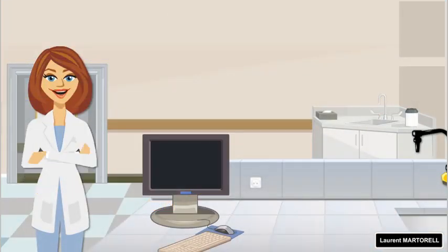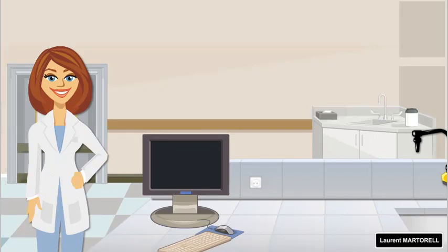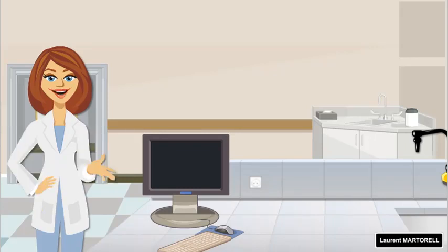Hello. Welcome to my lab. My name is Jane, and I'm a biochemistry teacher. Today we are going to talk about titration. Have you ever wanted to know how a scientist can determine the exact concentration of a dissolved substance in a solution?